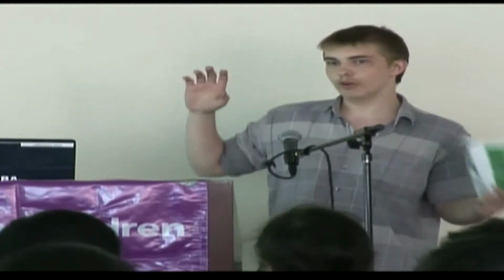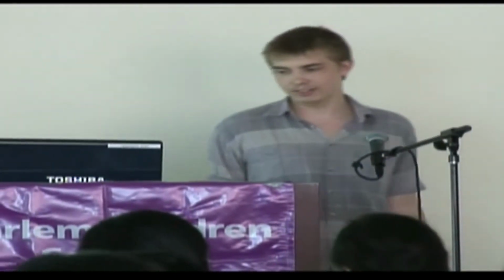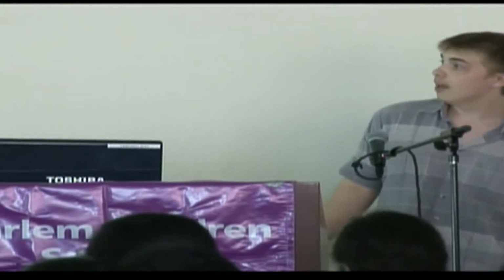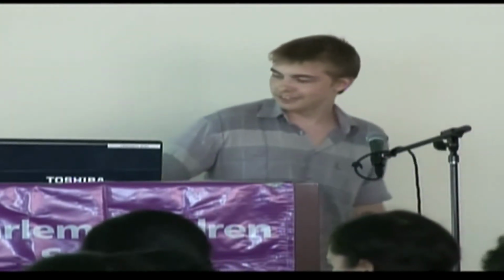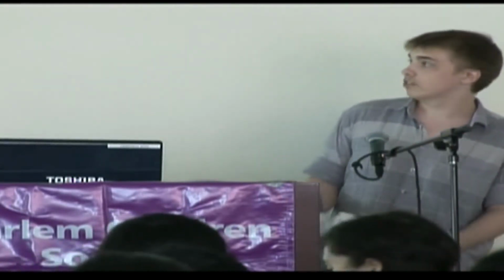So my overall project consists of these 4 major steps. The first step is transformation. The second step is grow colonies. The third step, regulation of gene expression, and the fourth is purification. I will explain them as I go along. All right, first is transformation.